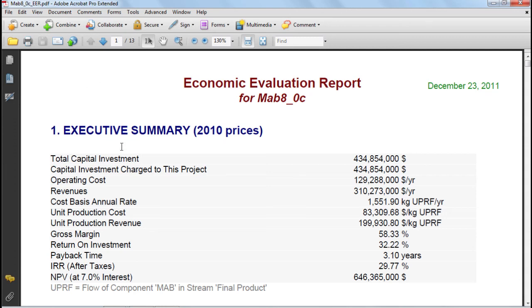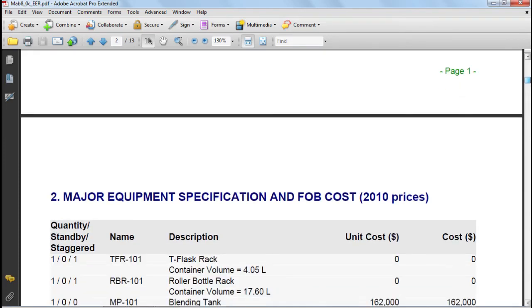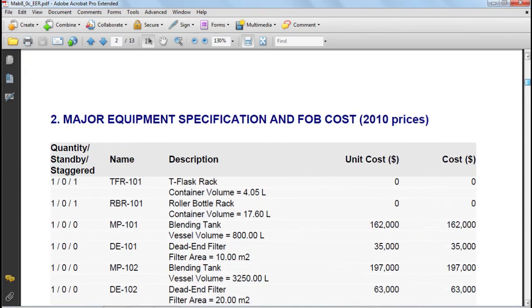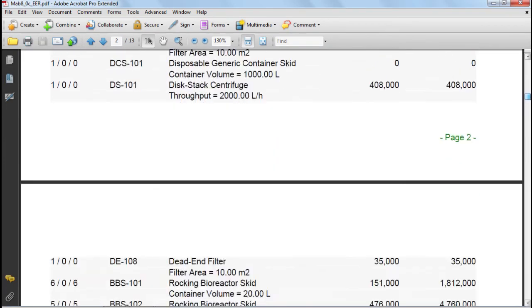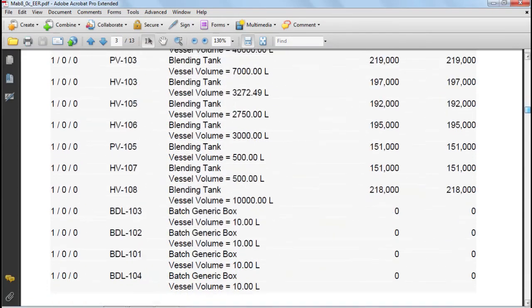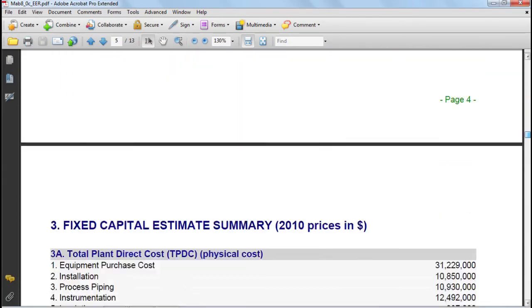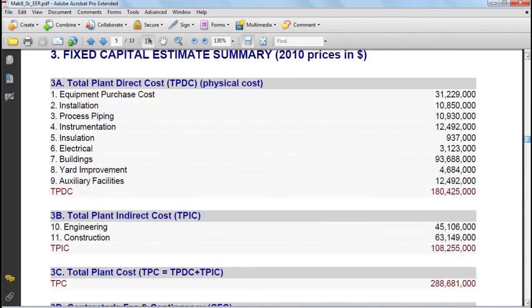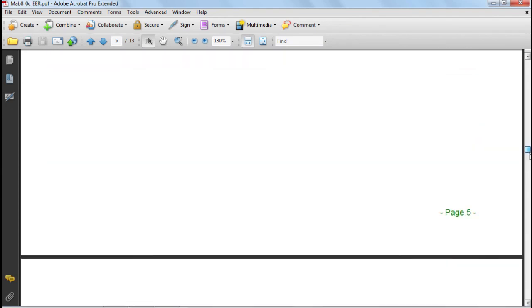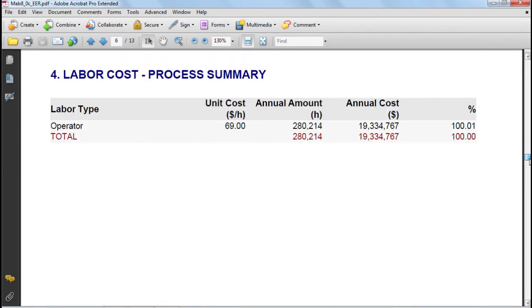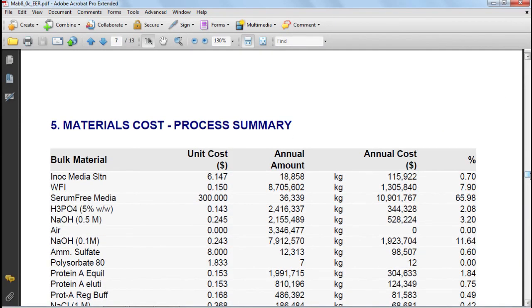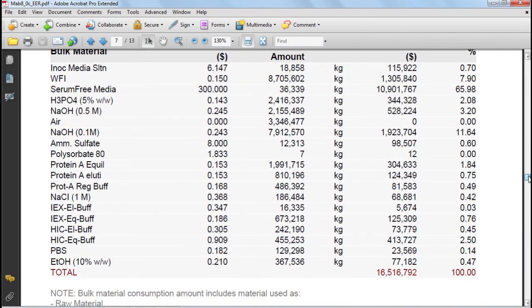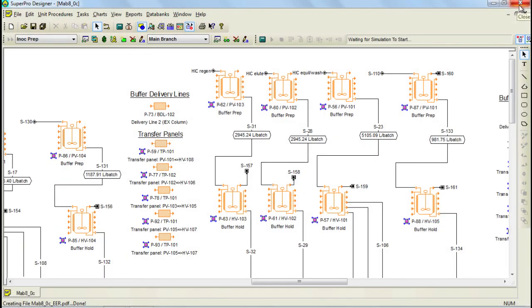Through this report, various cost-related items are reported, such as the Executive Summary, and further down, there is a more specific breakdown of the costs. All the different items that are shown below have been discussed in the cost analysis tutorial, which you can also find through our website. This concludes part 1 of this video tutorial. Please make sure to watch part 2, where I'll discuss the details of this model. Thanks for your attention.